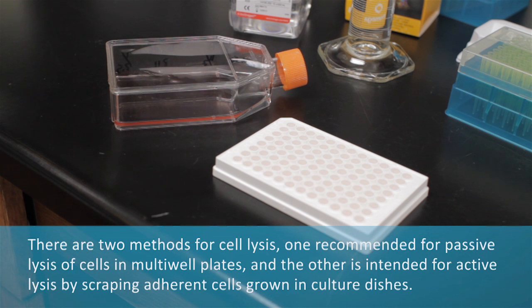There are two methods for cell lysis: one recommended for passive lysis of cells in multi-well plates, and the other intended for active lysis by scraping adherent cells grown in cultured dishes.